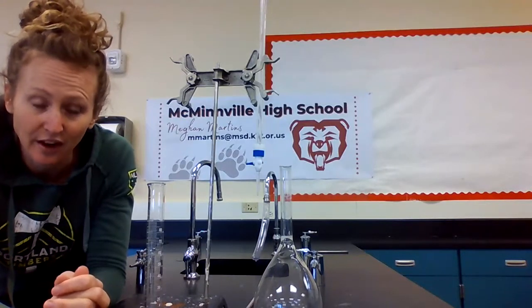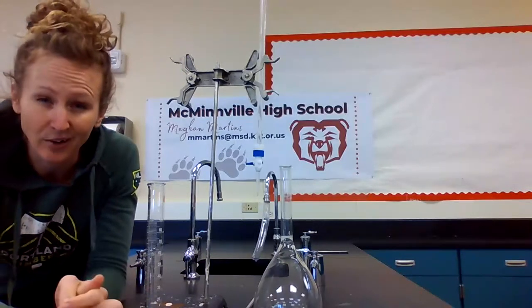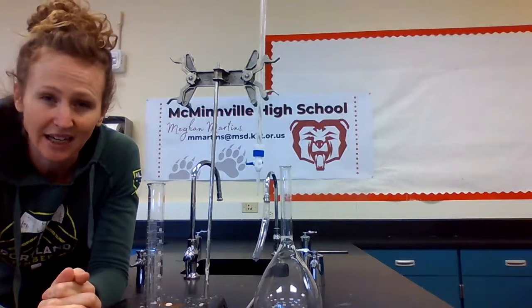For example, mercury is a really important thing to evaluate in water sources, but mercury usually exists in pretty small amounts. So we probably wouldn't be able to detect those teeny tiny amounts of mercury using a spectrophotometer, even though those teeny tiny amounts of mercury are a really big deal. Mercury, if you get it in your body, it doesn't get processed and spit back out of your body. Your body actually stores it. And so if you get a little bit of mercury inside your body over and over and over for 10 years, 20 years, 30 years, that little tiny bit of mercury that our spectrophotometer can't detect becomes a really big deal.